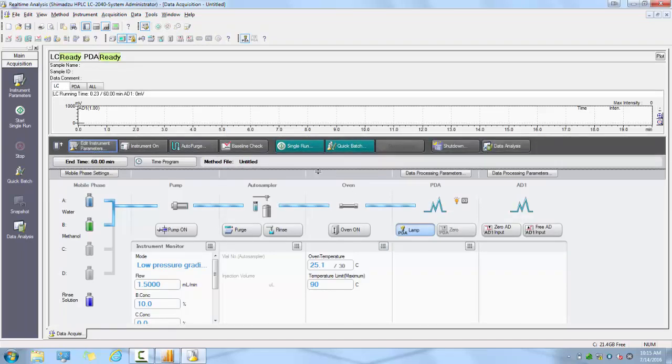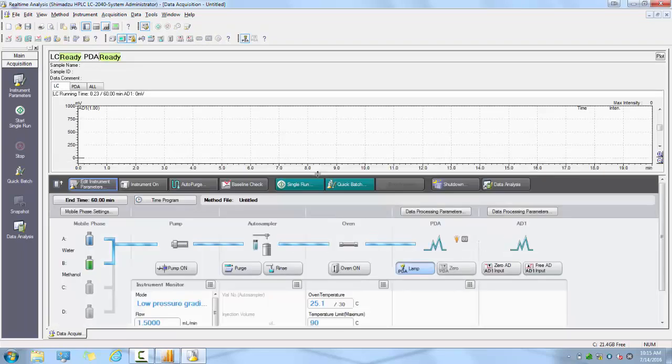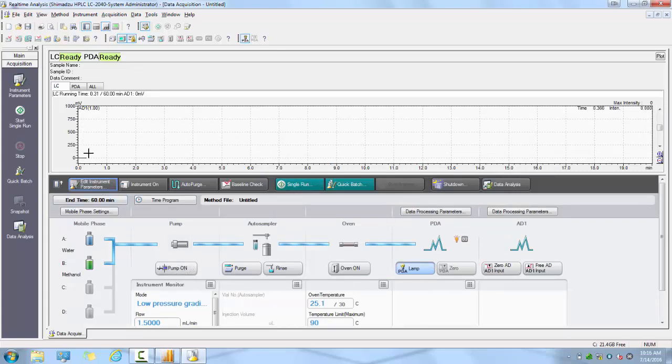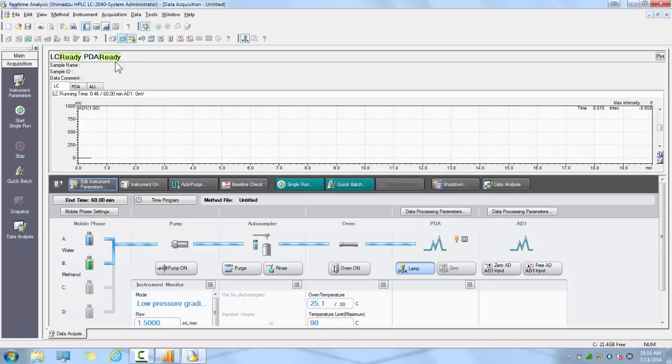From this screen in real-time analysis, you will be able to control your instrument, set your method conditions, perform injections, and observe your data as it is being acquired. Now that you have configured your system communication settings and hardware configuration, you will be able to launch directly to that instrument from the instrument tab.